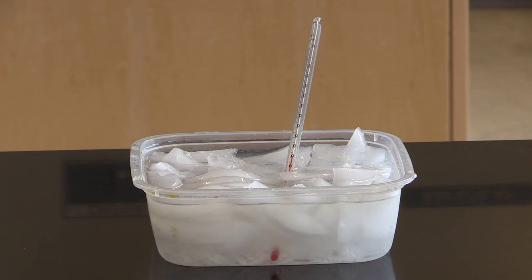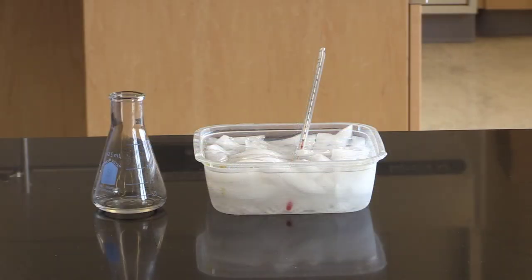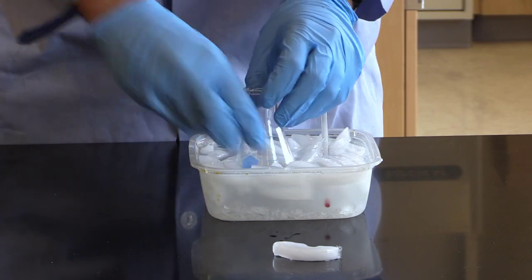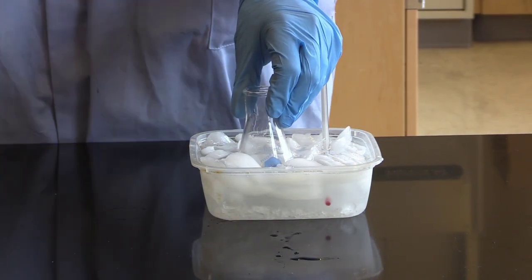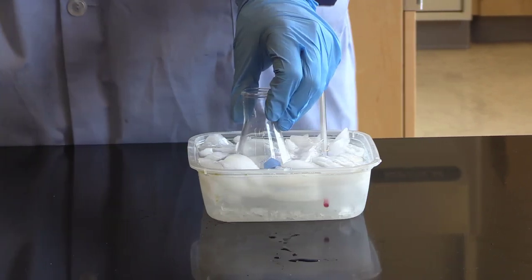By having a rock salt ice bath, this will ensure that the aspirin crashes out of the solution. Our flask has now reached room temperature, so we can put it into the rock salt ice bath. We're going to let it sit for 15 minutes. During those 15 minutes, we should start to see the aspirin crystals form.